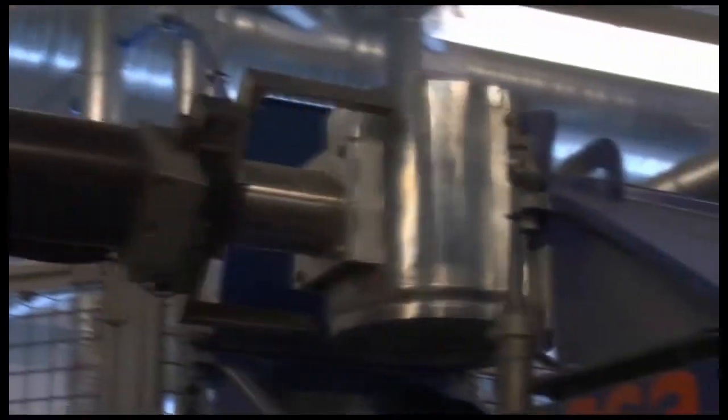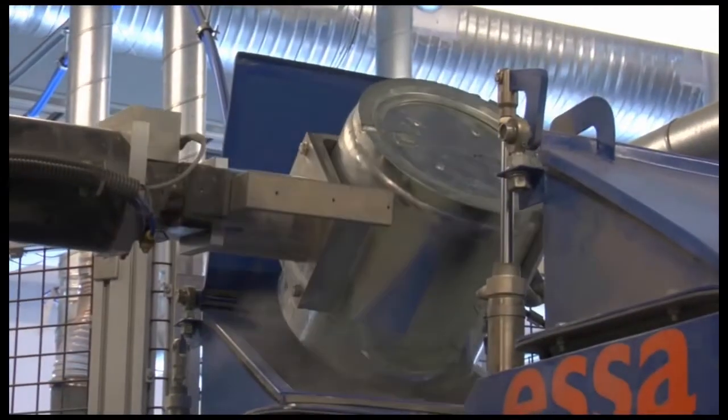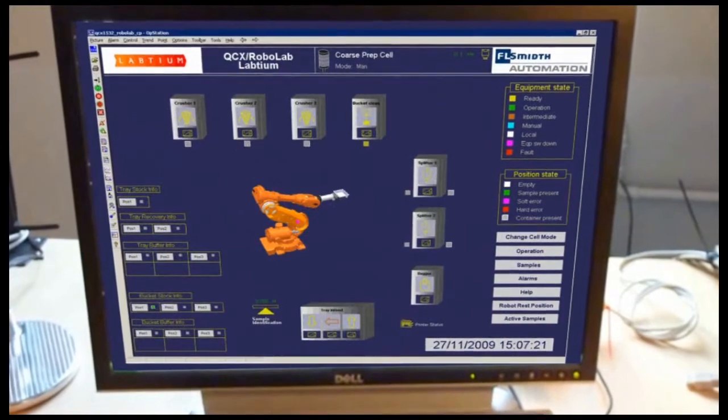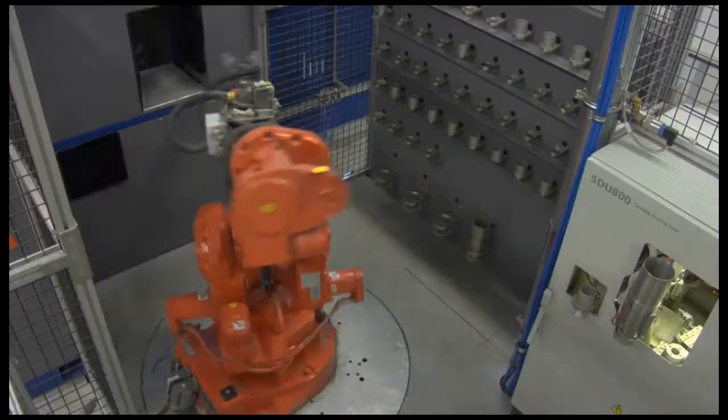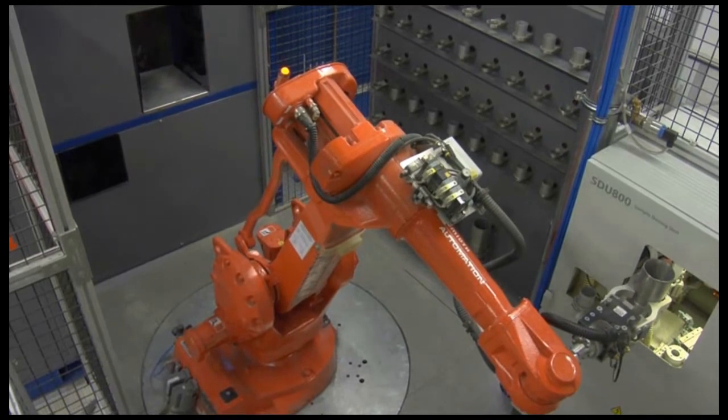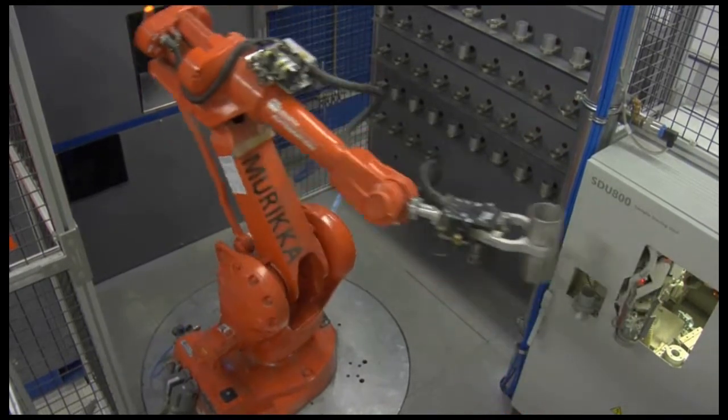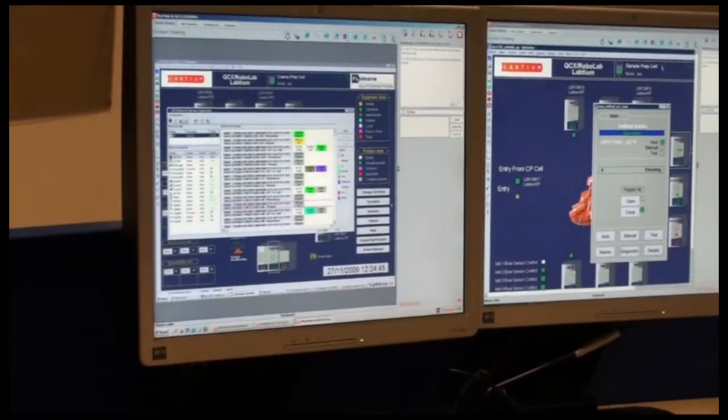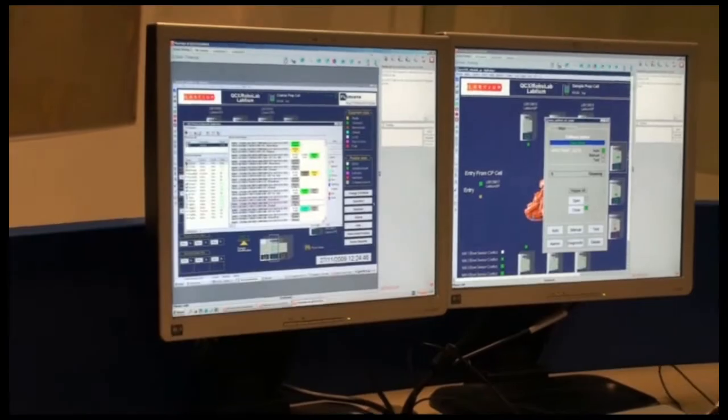Because all sample handling and machine control is done by the QCX software, it is easy to change or add new sample recipes, new pieces of equipment, etc. The overall QCX QA, QC software controls which samples shall be duplicated or triplicated based on the sample recipe and overall QA, QC scheme.